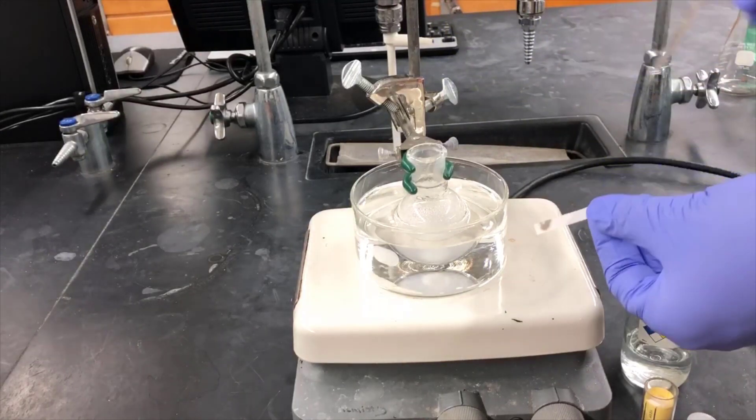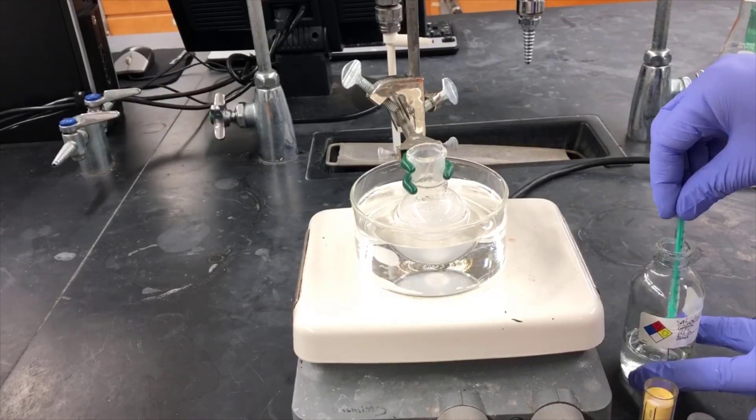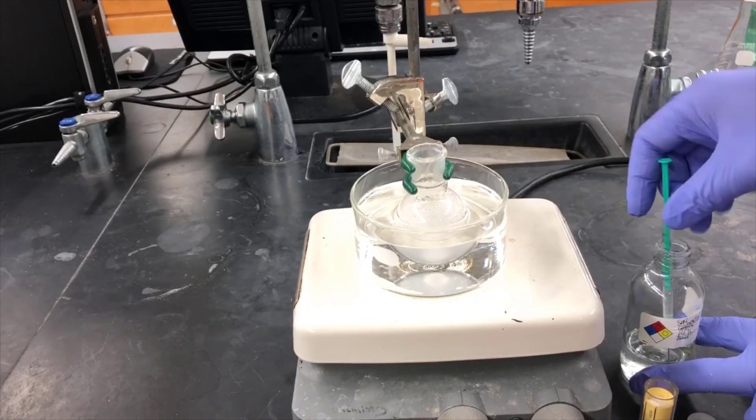From the black color on the test strip, it's clear there's still hypochlorous acid present, so I'll add another 0.5 milliliters of the saturated sodium bisulfite solution and test again.